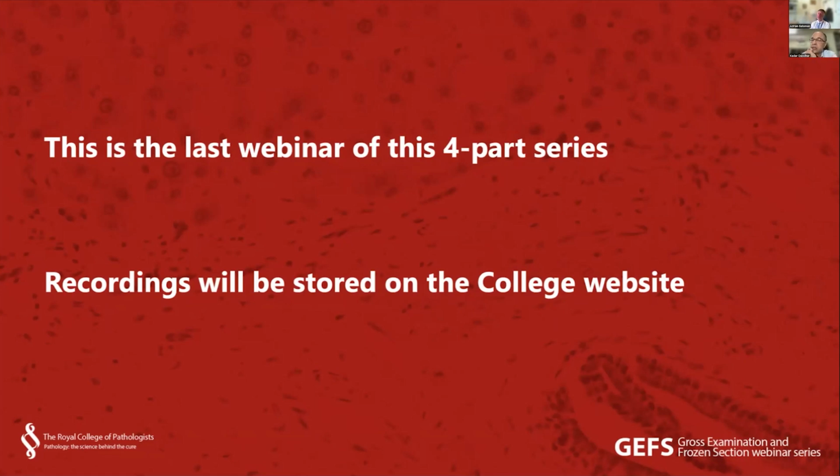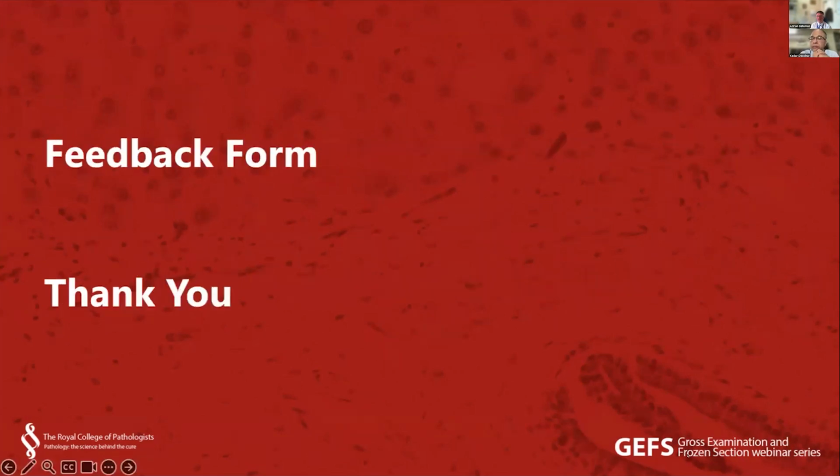What are your thoughts on that? That's very interesting. I haven't heard our clinicians mention that, but I can imagine why people might think that was important, because you might feel that if there was extramural mucin, even if it was acellular, that could suggest that the tumor was a higher stage before the chemotherapy was given. And of course, chemotherapy will generally be given for tumors that would be a more advanced pT stage anyway. So that's not something I've actually had experience of, but I'm interested to hear that actually.